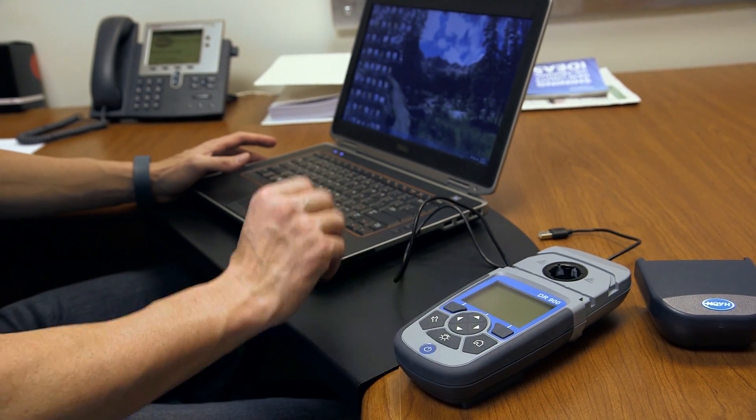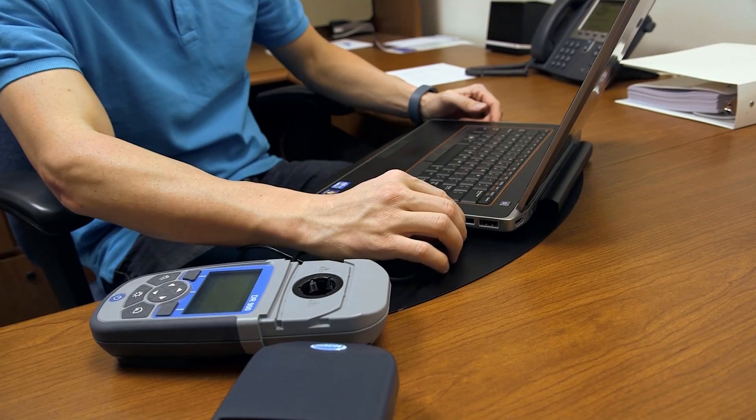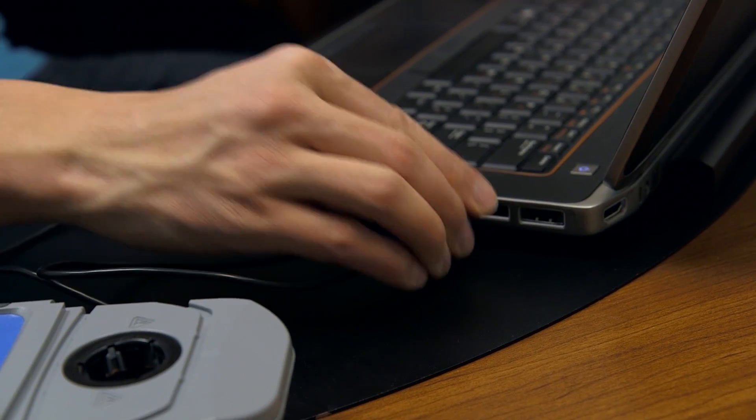Store data for up to 500 tests, and use the USB port for simple downloading or transferring of information.